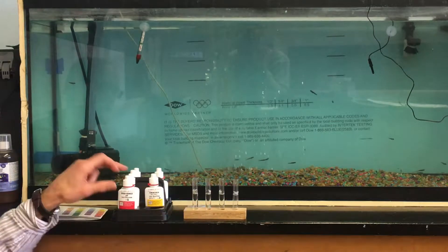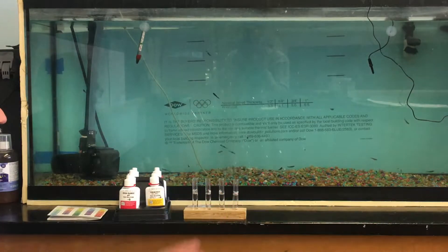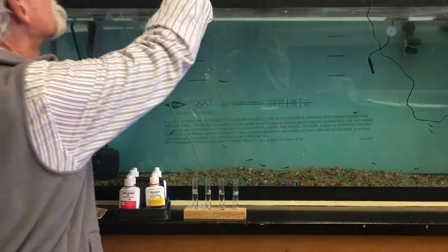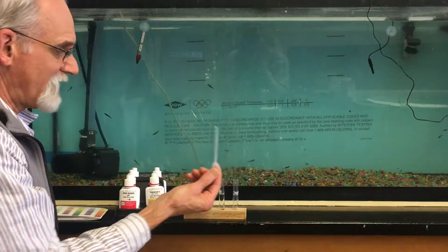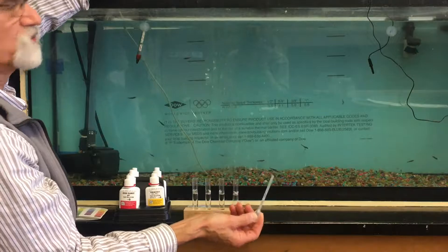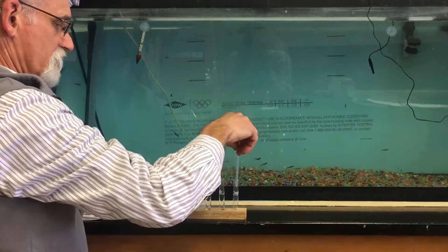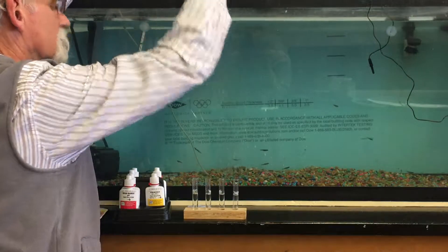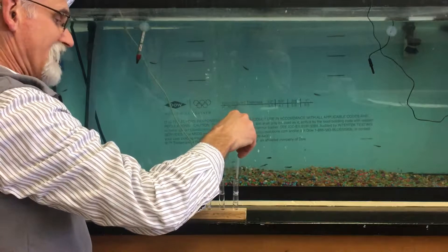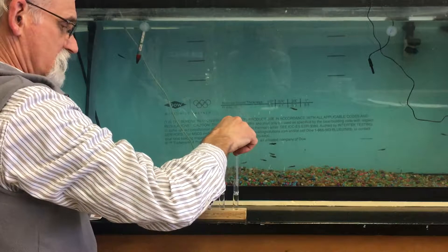We start by unpacking the kit and setting up the test tubes in the test tube holder so we can do them in order. I've already filled three of the test tubes, but I'll show you how. We use a small pipette to get water from the tank without putting the test tube in the tank — reach up, suck up water, and put it into the test tube.